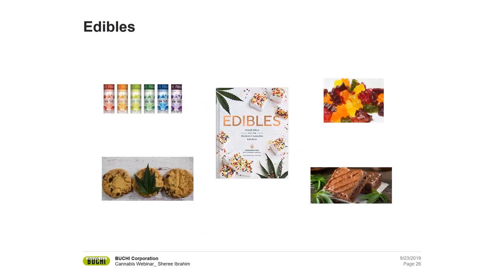Edibles. Folks use cannabis to make edibles, such as brownies, cookies, drinks, and gummies. Edibles require testing for cannabinoids, and the challenge of testing is that sometimes the sample can have a higher or lower cannabinoid concentration because it's not homogeneous. It could also include other compounds such as fat or sugars, which affects the final result. You can use flash chromatography as a sample preparation method before testing.